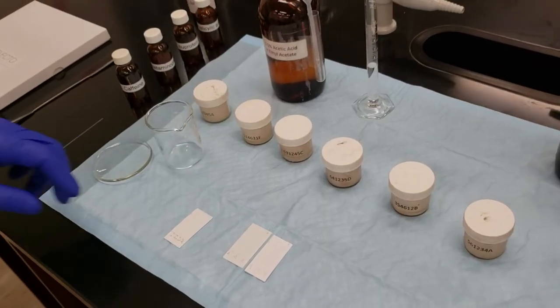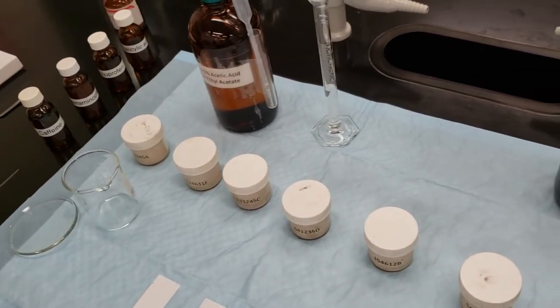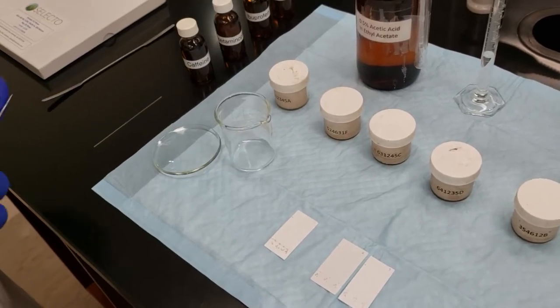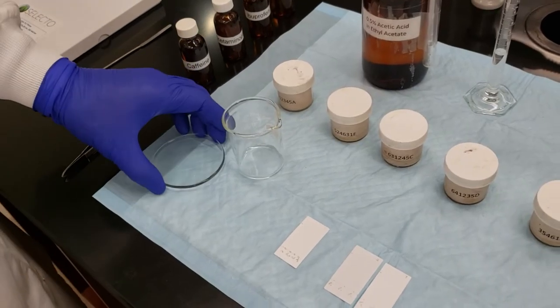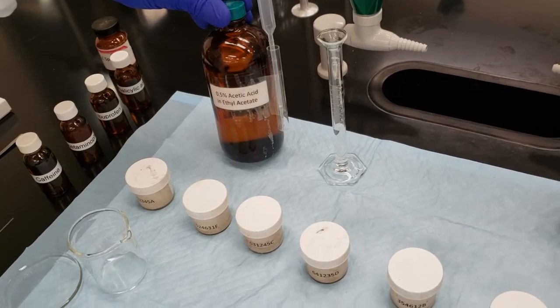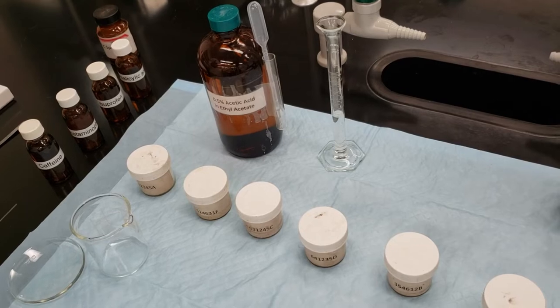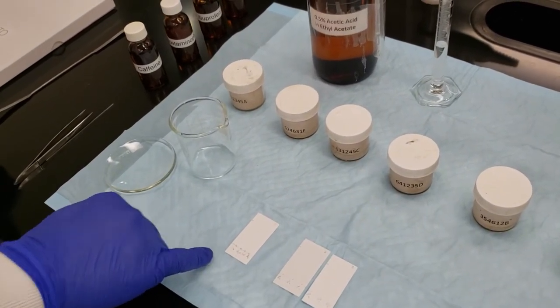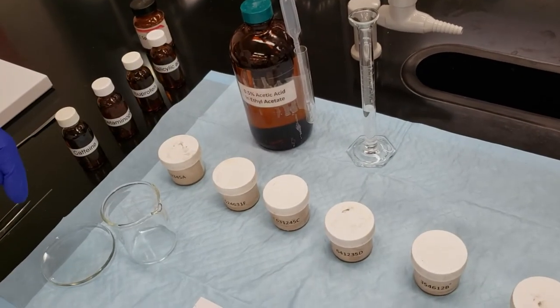So we finished spotting our first plate with our known analgesic components. Now we've got to set up our solvent chamber, our developing chamber, for our TLC experiment. We're going to be using a 100 ml beaker, a watch glass, and 5 milliliters of 0.5% acetic acid in ethyl acetate. That's going to be our developing solution, our mobile phase. So we have our solid phase, or our stationary phase, which is our silica gel. Our mobile phase will be our acetic acid in ethyl acetate.